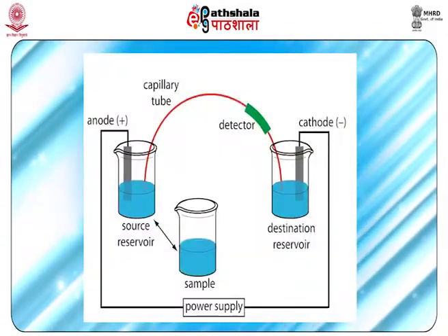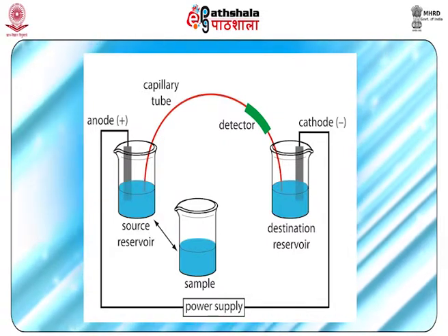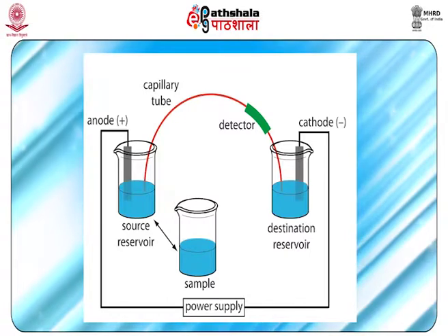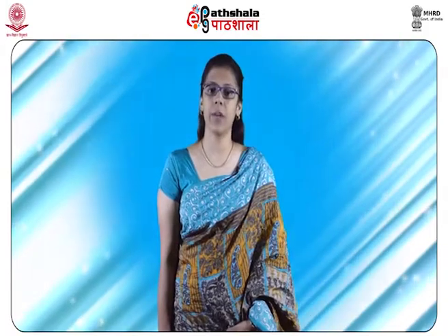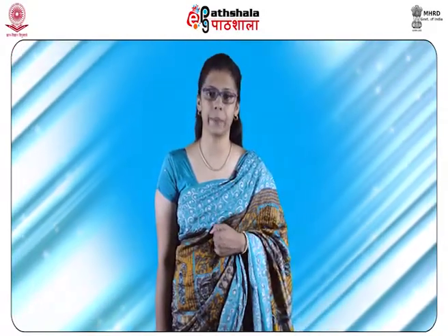In the CE method, analytes migrate through the electrolyte solution under the influence of an electric field. Analytes can be separated according to ionic mobility. Additionally, they may be concentrated by means of gradients in conductivity and pH. Its forensic application was first given by Weinberger and Leroy. Capillary electrophoresis is attractive for forensic analysis for its minimal sample preparation, low reagent use and waste production, and its separation power, followed by a quick analysis.